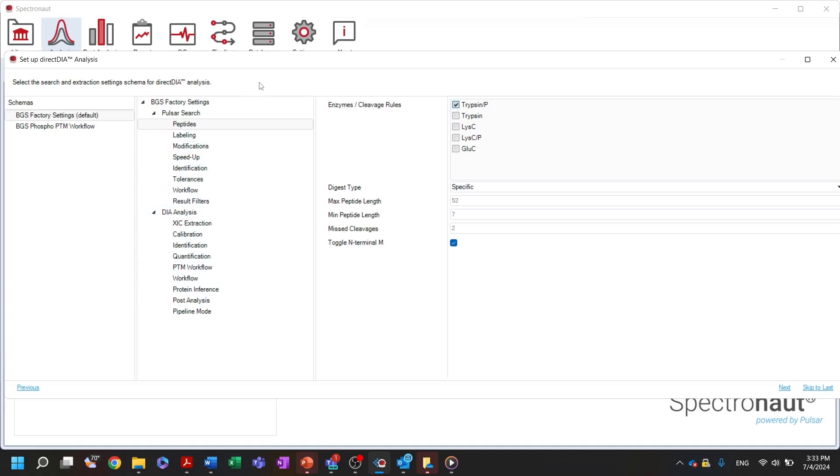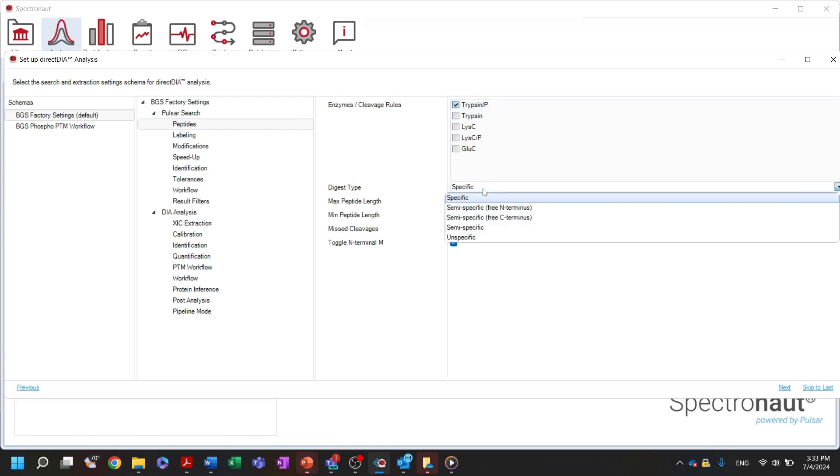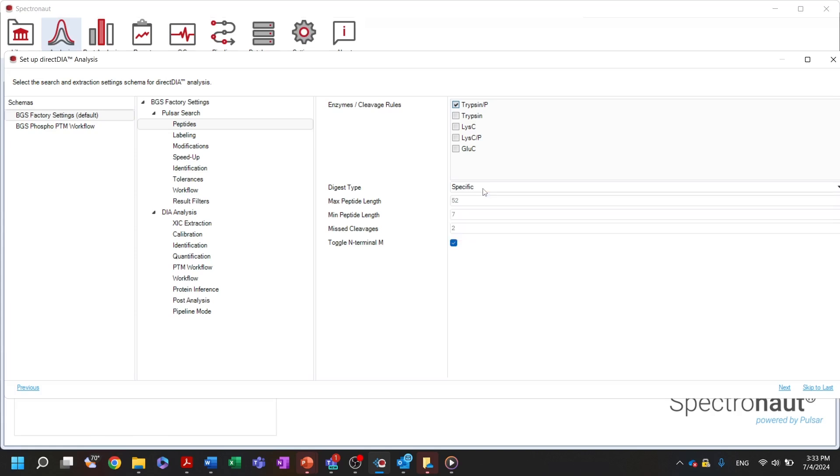In the first part, you can select the type of enzyme used as the protease in each experiment. Spectronaut also supports unspecific digestion and custom digestion rules predefined by the user in the database perspective. Here you can also select the maximum and minimum peptide length for the search as well as the number of allowed misclavages. This is particularly useful for unspecific digestion workflows, including peptidomics data or searches with multiple variable modifications that create a bigger search space.